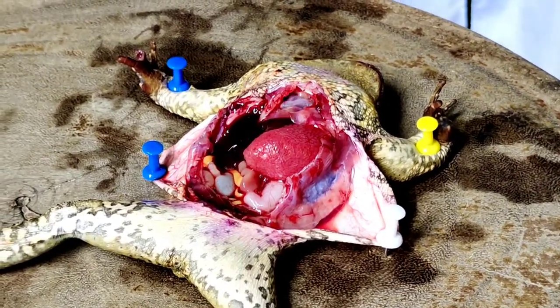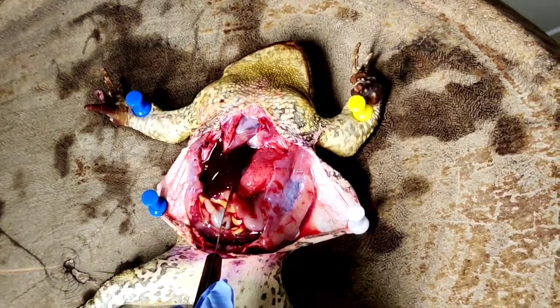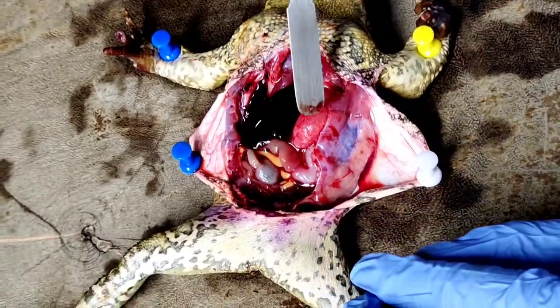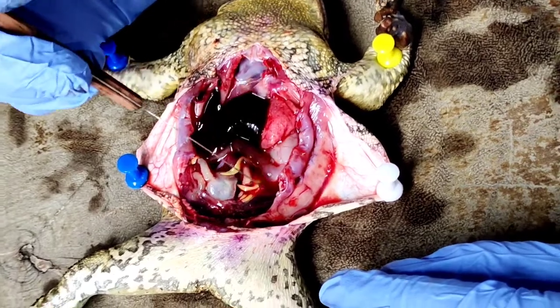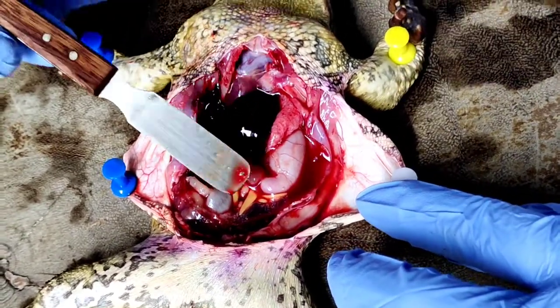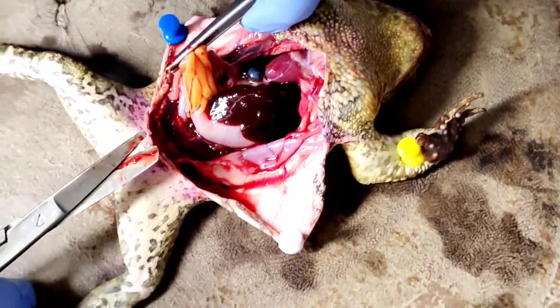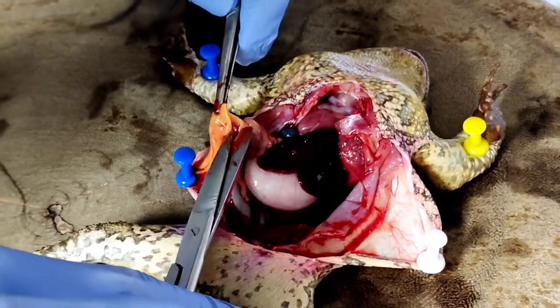The frog's internal organs are now exposed and ready to be examined. We used the flapper tool to examine the organs individually. We will now extract all the organs, starting off with the fat bodies, which is this yellowish organ.